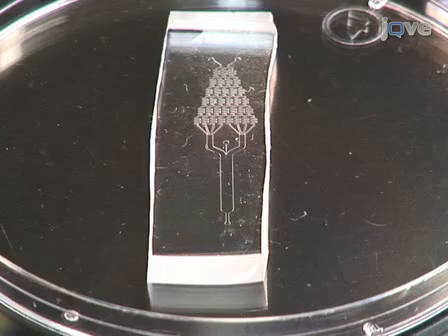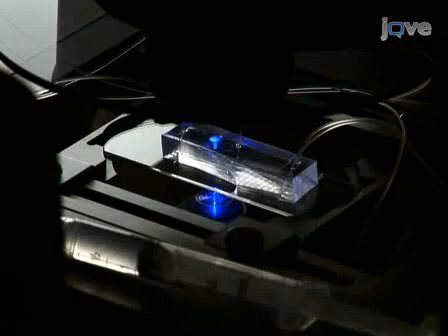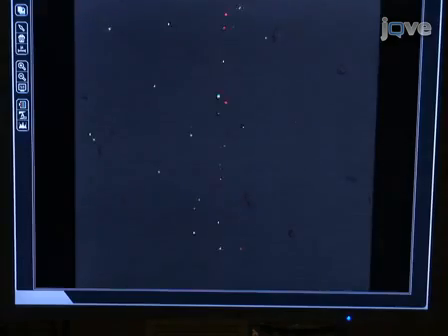Hi, I'm Derek Englert from the Laboratory of Molecular Systems Biotechnology in the Department of Chemical Engineering at Texas A&M University. Today we'll show you a procedure investigating bacterial chemotaxis in a microfluidic device. We use this procedure in our laboratories to study how E. coli RP437 migrates in concentration gradient of nickel sulfate. So let's get started.